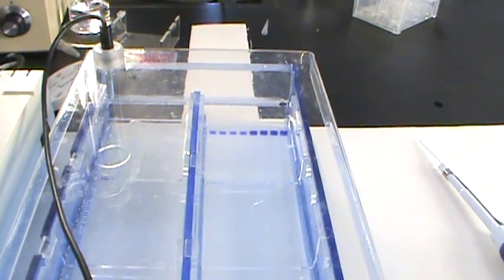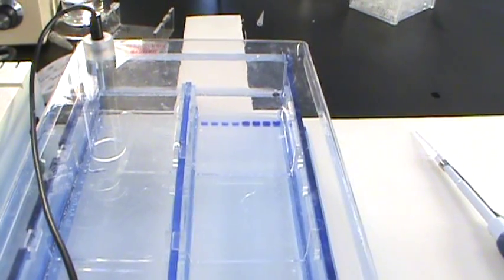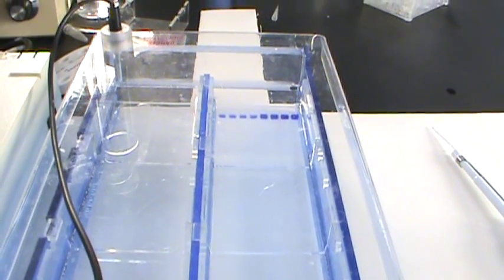In the olden days, they didn't use to color code these wires, and there were times that we set up electrophoresis units, turned our backs, and our sample had migrated out the top and into the buffer. We don't want that to happen. After the bands have just about reached the end of the gel, don't let them run off, but after they've just about reached the end of the gel, then you will want to turn off the power on the power supply, unplug the machine, and then unplug the top of the electrophoresis unit from the holder. Then you're ready to take the gel out and stain it.